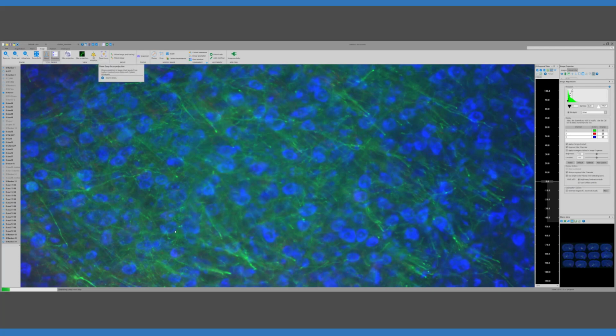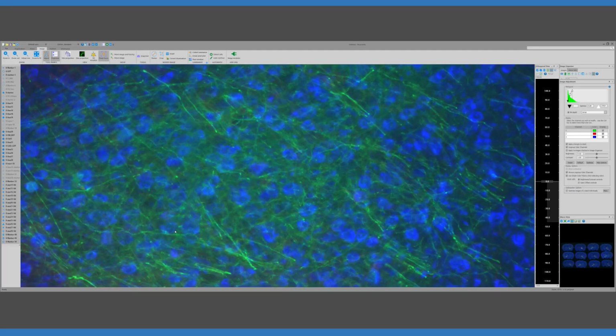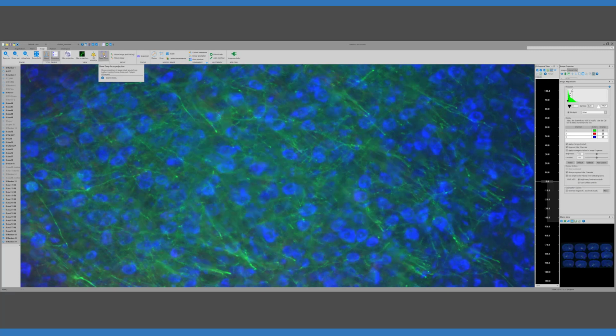Okay, great. As Chip mentioned, this works on stacks of images, so focal stacks, where each plane is taken at a different focal position with the microscope. And what we do is we project from the 3D image stack into a 2D plane. It's very much like a maximum intensity projection, except instead of using intensity for figuring out what to preserve in that 2D projection, we're using focus. So we evaluate focus everywhere in that stack. At each location, we select the plane where the focus score is the maximum, and that determines what information gets preserved in that 2D projection.